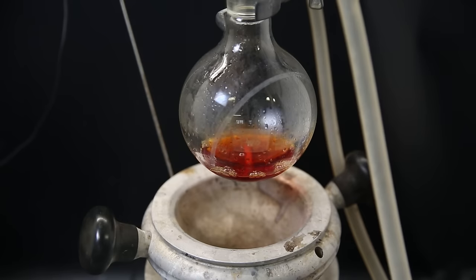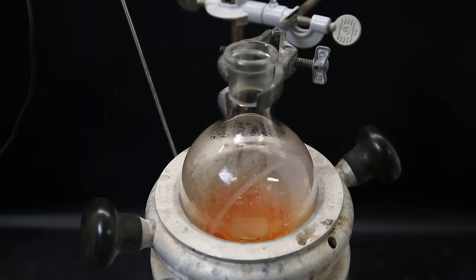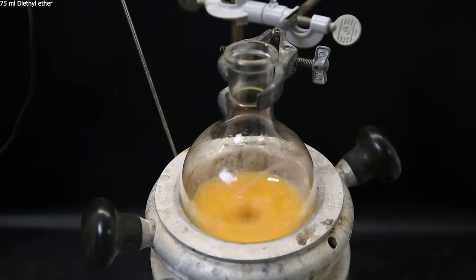When that is done, I take it off heat for a second and the mixture has turned red. I then distill off all of the volatiles and I am left with a red-orange solid. I then triturate the solid by adding diethyl ether, which will dissolve impurities but not the product. We can see a light solid separate out, and the orange impurity is dissolving in the ether.